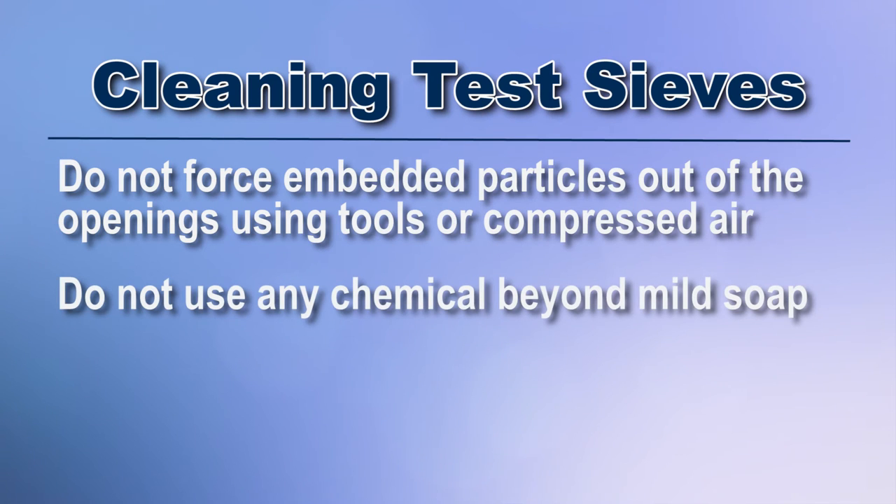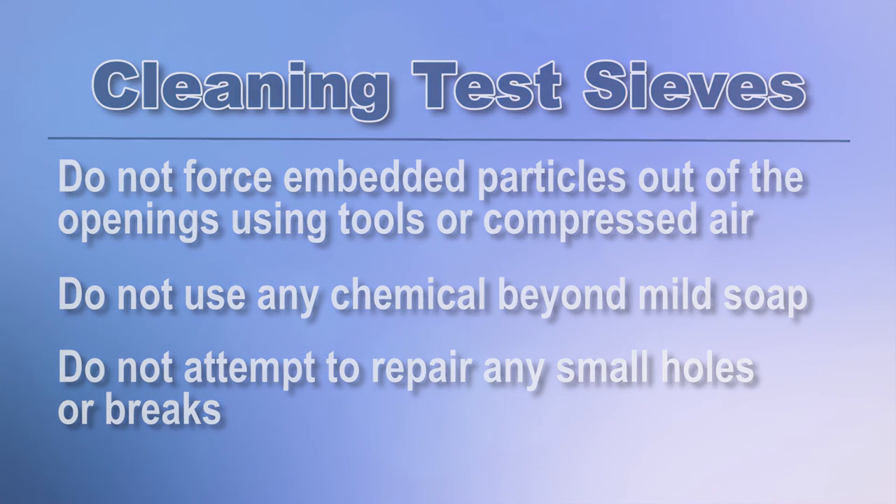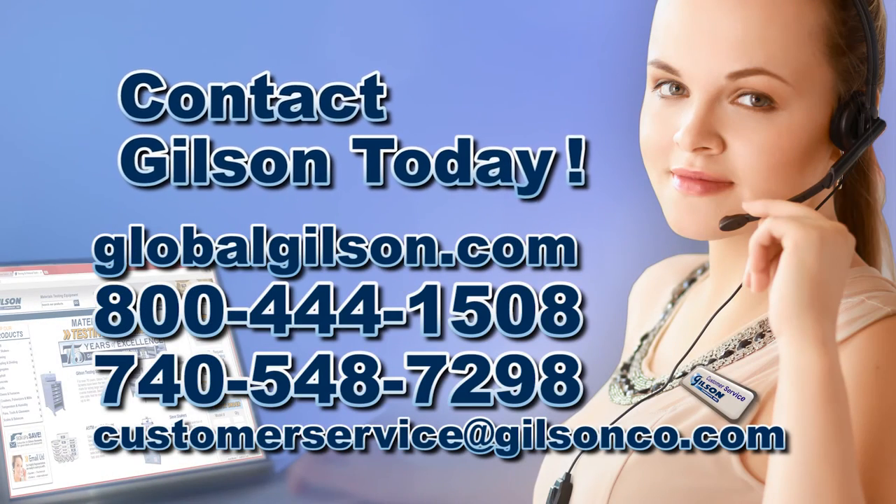Do not use any chemical beyond mild soap to wash your sieves, as they can alter the sieve opening and limit the lifespan of the sieve. Do not attempt to repair any small holes or breaks, and discontinue use of any test sieve if the wire is worn, loose, or damaged. Examine your sieves frequently.